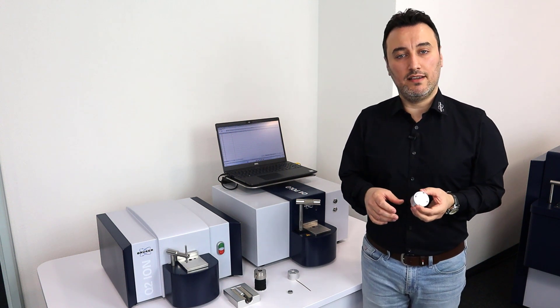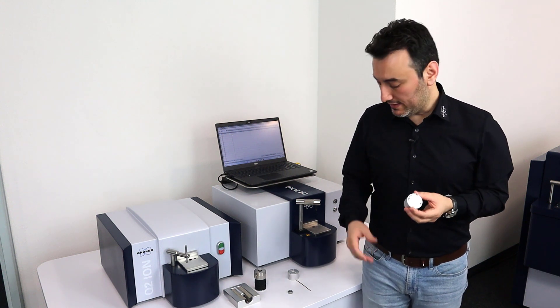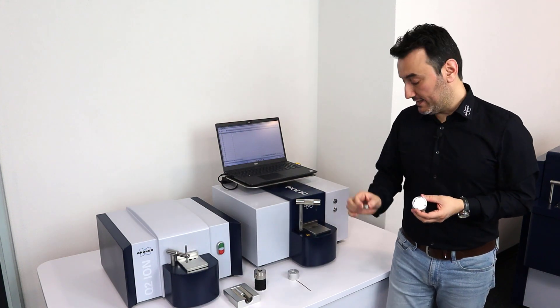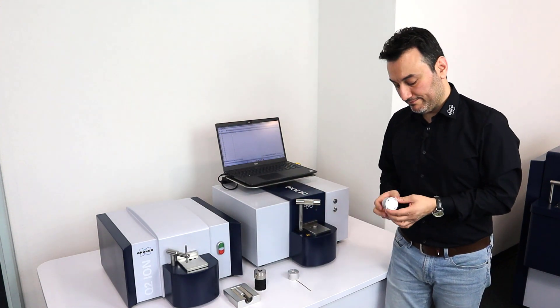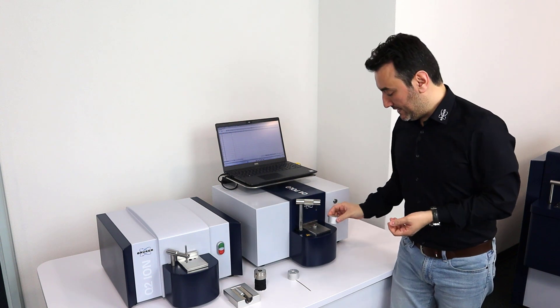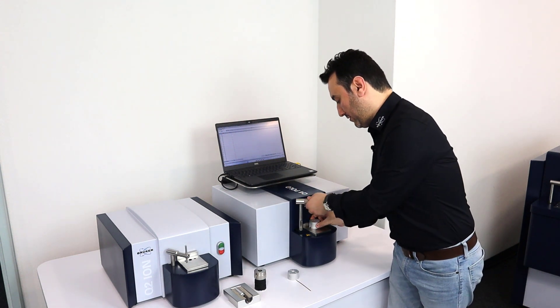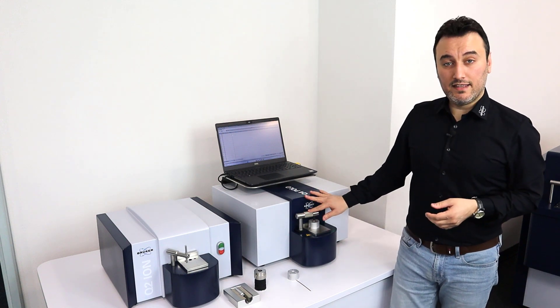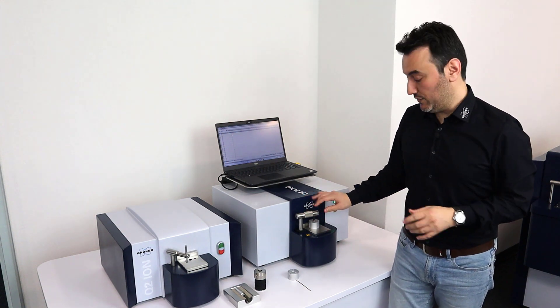With this adapter we can analyze small samples like washers, bolts, and nuts. What I have to do is place my sample on the spark stand plate, then place this adapter right on top of it, and then lower the clamp. And the system is ready to analyze again.